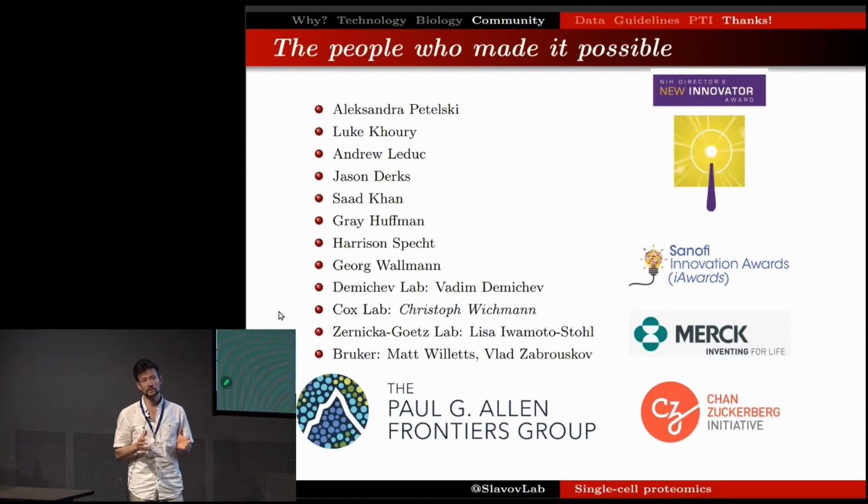In other experiments, in most of the experiments that we did, we put the proteins based on biological relevance. We studied immune responses. We had done some bulk analysis, and we knew which are the proteins that are likely to be most biologically relevant. So we put those. Certainly, post-translationally modified proteins can go on the first priority tier.